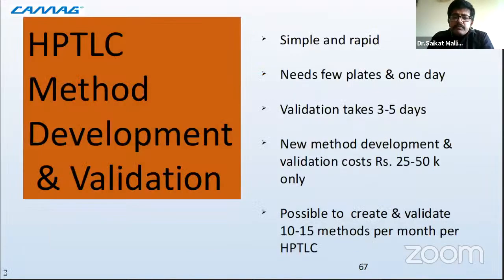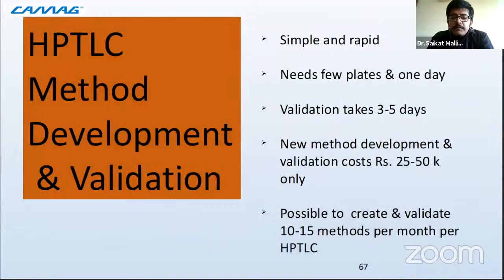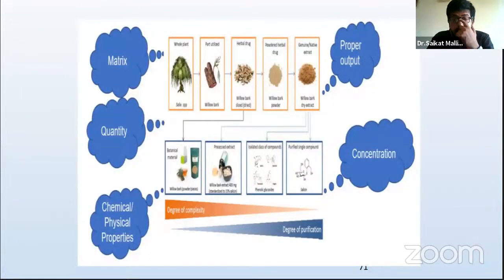This is about quality control of traditional medicines, which you can see. Method validation is also an important aspect. We'll just go through these slides. And now let us go into understanding herbal applications.